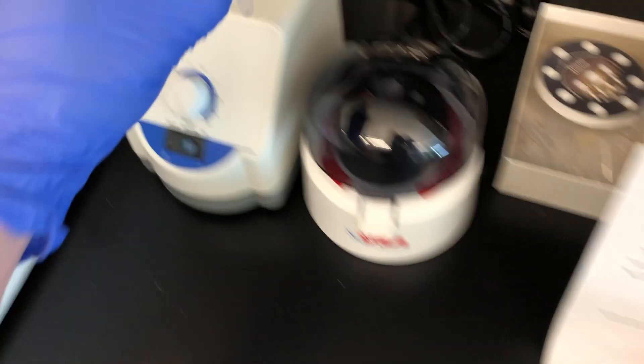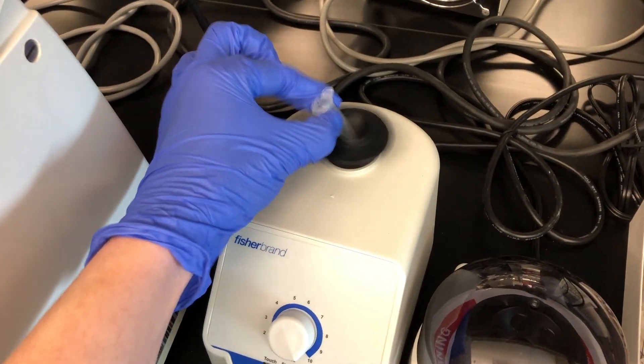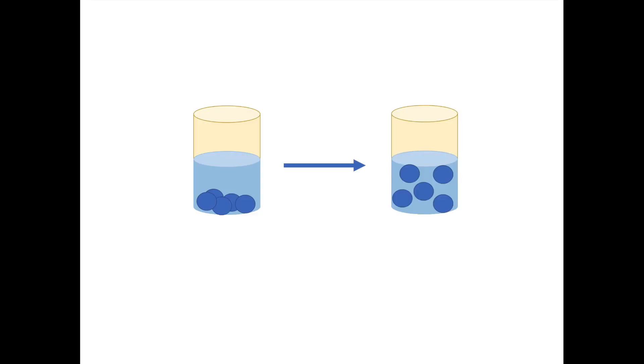While the protein samples were stored in the freezer, the protein may have settled to the bottom. So I use a vortexer to shake up the sample and make sure that the protein is evenly distributed in the solution.